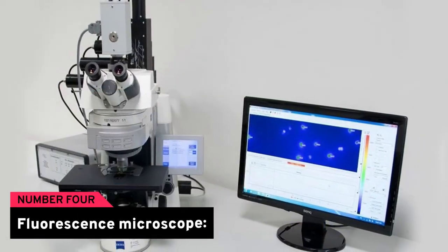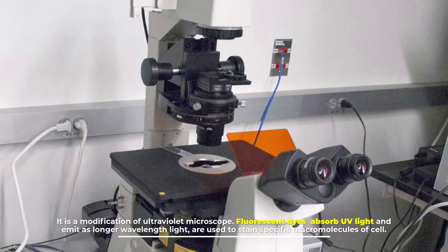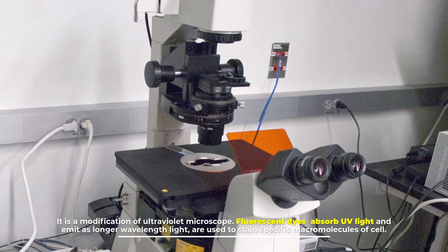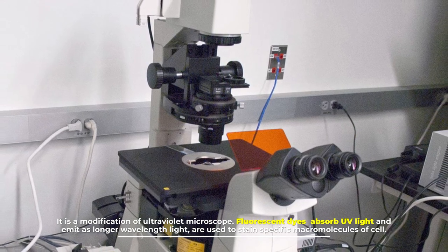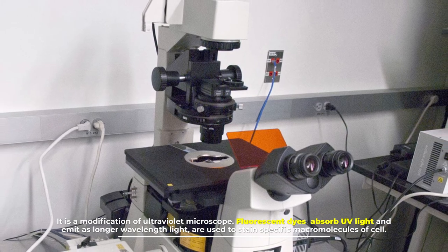Number four: fluorescence microscope. It is a modification of ultraviolet microscope. Fluorescent dyes absorb UV light and emit as longer wavelength light are used to stain specific macromolecules of cell.